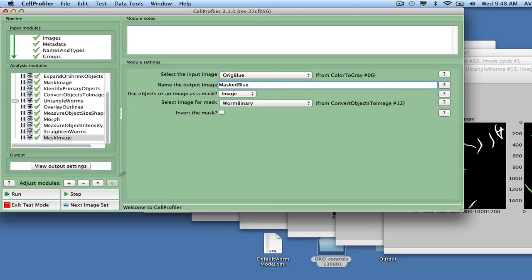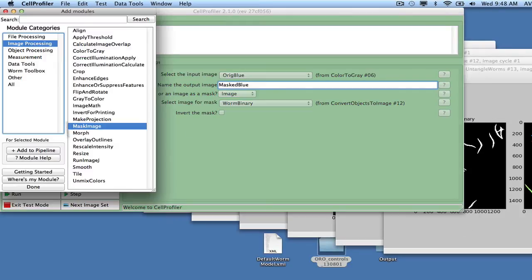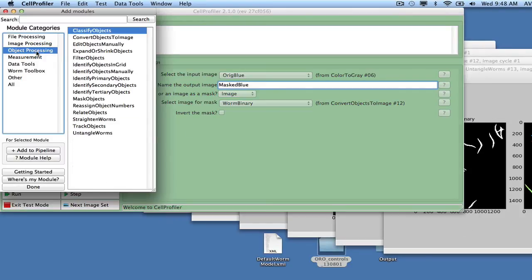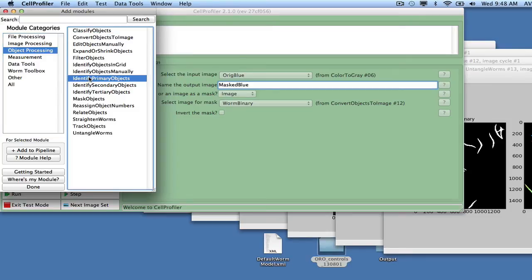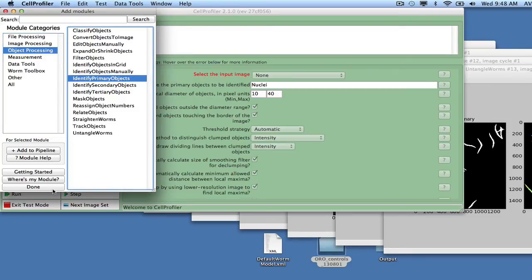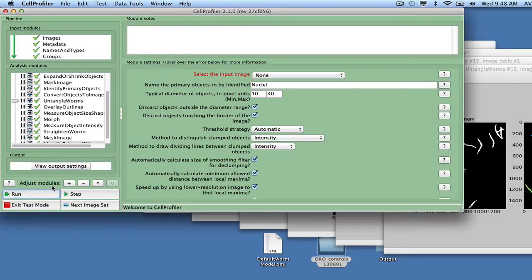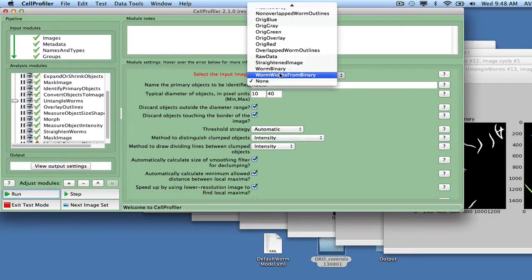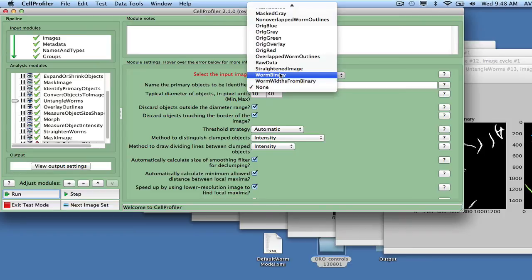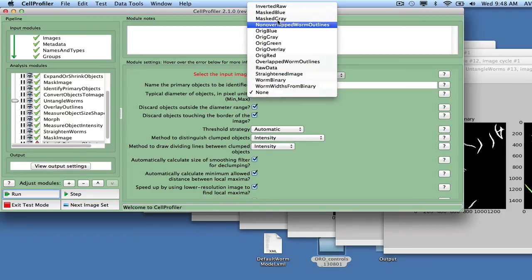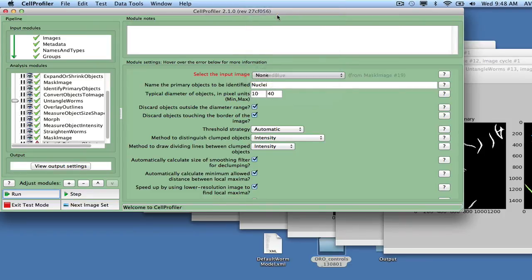Now we use Identify Primary Objects to find the fatty regions. This time we let their diameter vary in size from 5 pixels to 10,000 pixels, and specify a fixed intensity threshold for what is regarded as fat, set to 0.4 for this dataset.